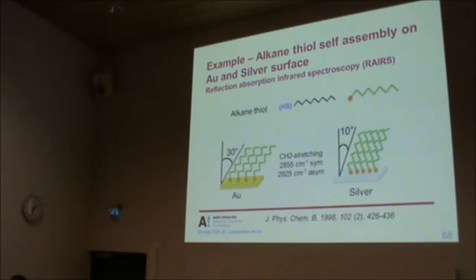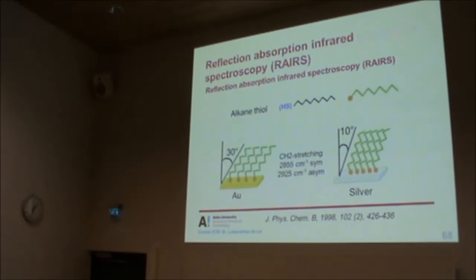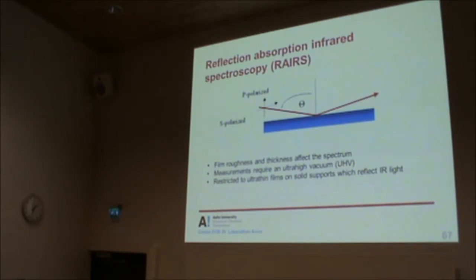Now, if you send a polarized beam, the vibrations in this beam are happening in only one plane. Now, the molecules that are present on the surface, if the vibrations of that molecule are aligned with the vibrations of the incoming light, the light will get absorbed.